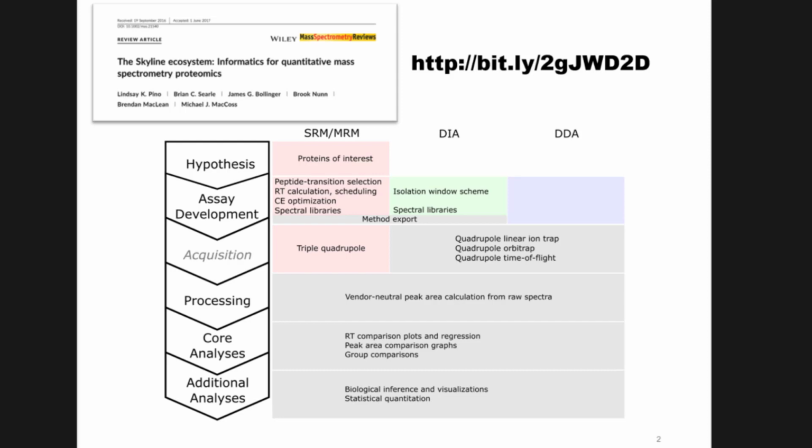There's a lot of places you might start. You might start with absolutely no idea what peptides you'd want to look for. So maybe you'd set up Skyline to just do what's called an in silico digestion. You would tell Skyline, take this protein sequence and give me every single possible peptide I might get from that protein. You might imagine that adds up to a lot of peptides very quickly, especially when you start considering like one miscleavage or potential modifications.